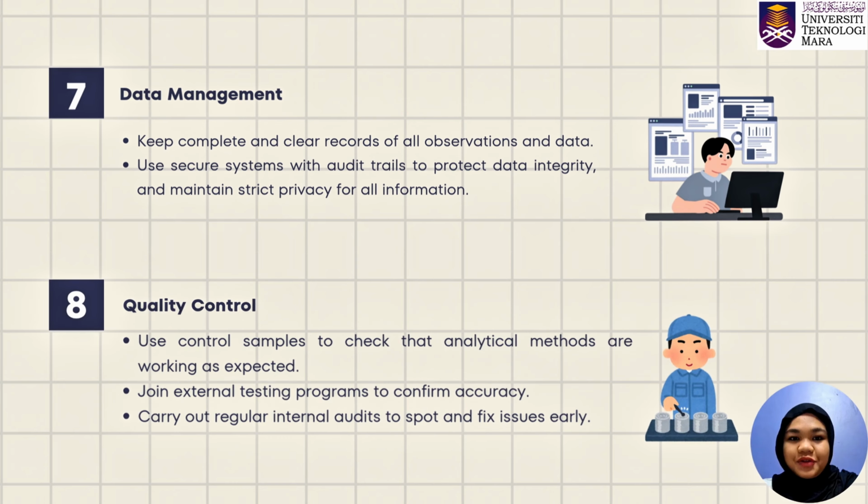Number 8. Quality controls. Use control samples to check that analytical methods are working as expected. Join external testing programs to confirm accuracy. Carry out regular internal audits to spot and fix issues early.